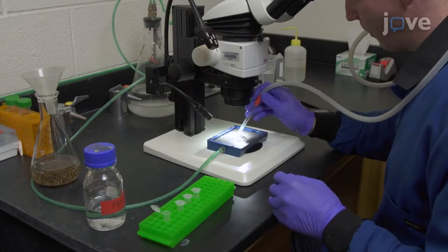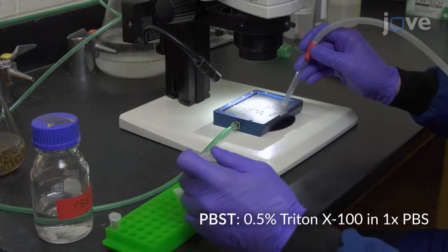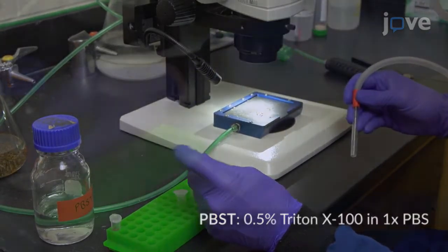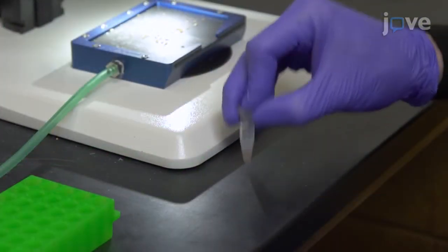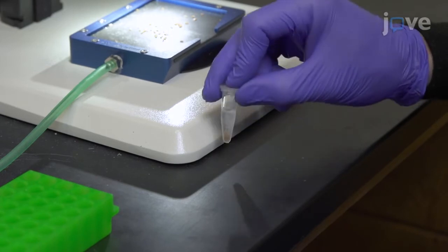After selecting the developmental time point of interest for imaging, transfer 5 to 20 animals into 1 milliliter of PBST in a 1.5 milliliter microcentrifuge tube, and incubate the tube for 5 minutes at room temperature with periodic tapping to assist the removal of hydrophobic coating and allow the animals to become fully submerged.